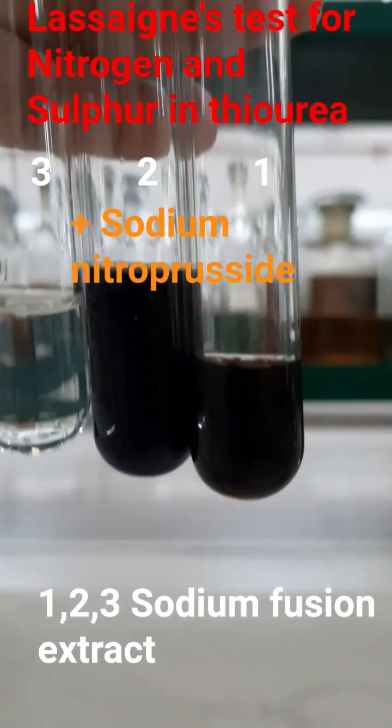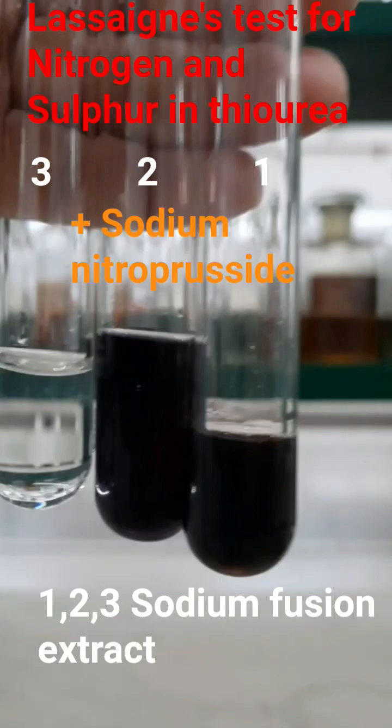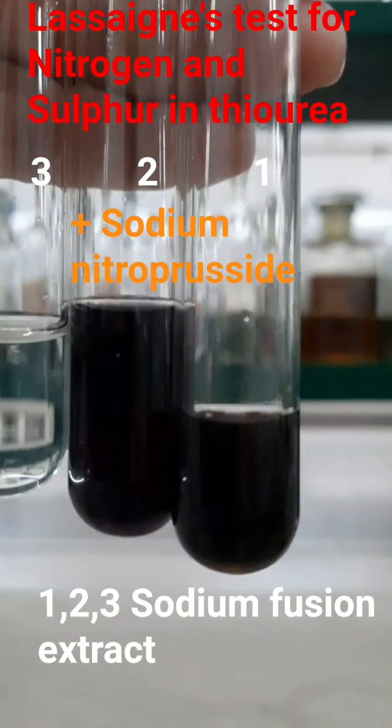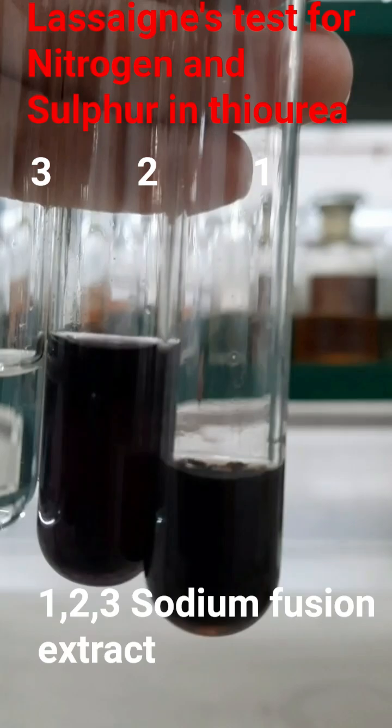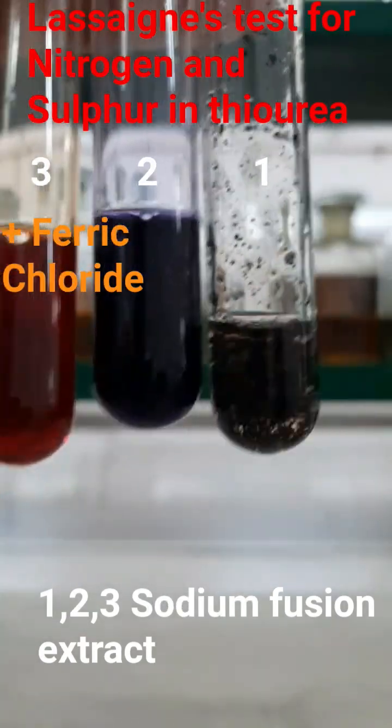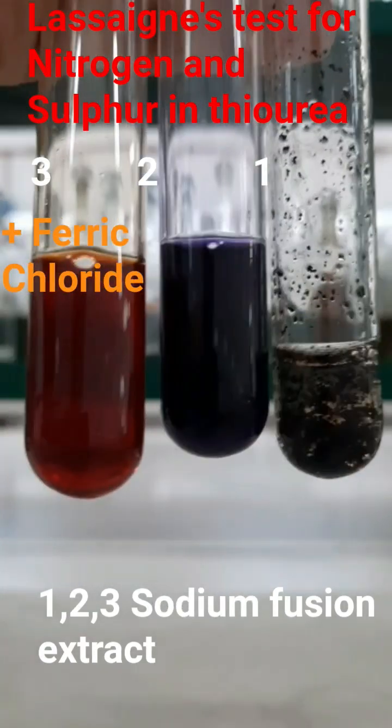In the second test tube, I am adding sodium nitroprusside solution and the appearance of violet color is due to the formation of sodium sulfonitroprusside. In the third test tube, I am going to add ferric chloride solution.